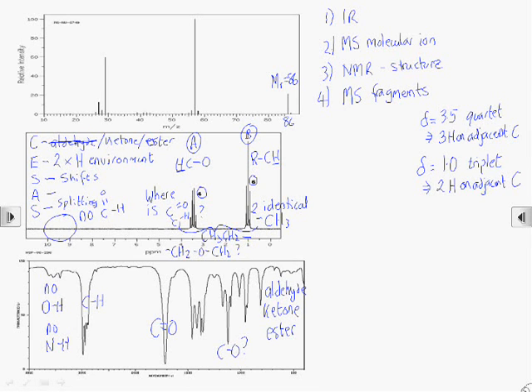Now we've got all the information out of the NMR, and we're fairly sure we've got ethyl groups, we need to start looking at what the mass spec can tell us. Going back to the idea that we've got a relative formula mass of 86, if we've got 2 ethyl groups they'd come to 29 each, so that would be 58.